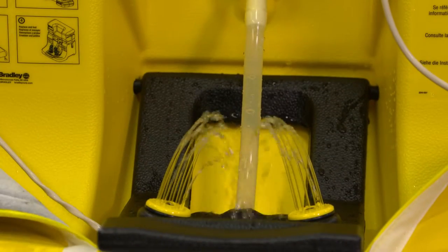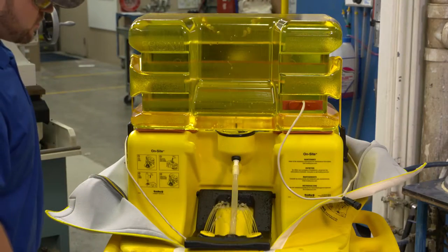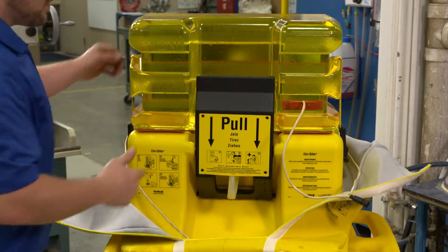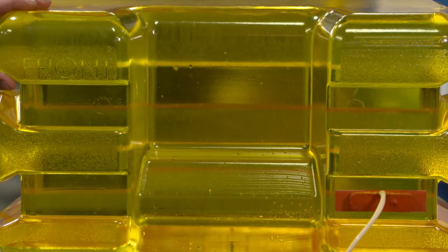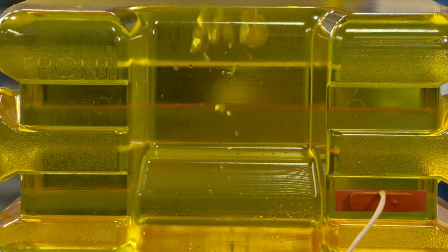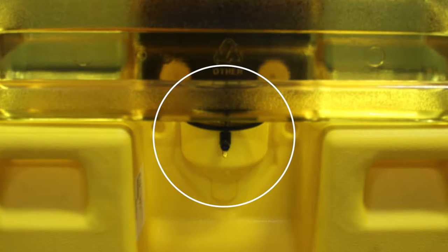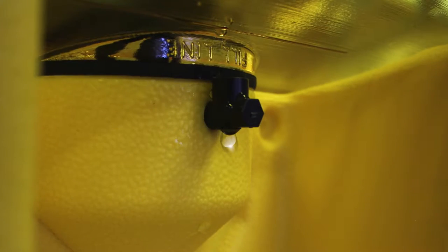Lower the arm and activate the water flow long enough so you can see air bubbles moving through the tank. Raise the arm and snap the eyewash back into position. This step burps the unit and balances water pressure in the system, preventing any leakage. Repeat the burping process again should you notice any water weeping from the snorkel.